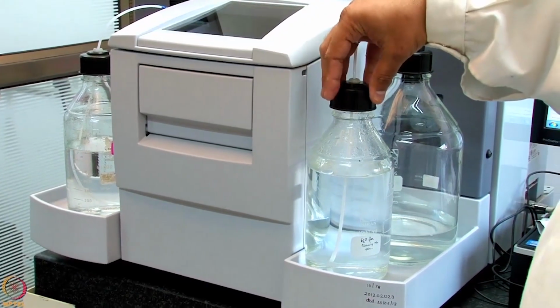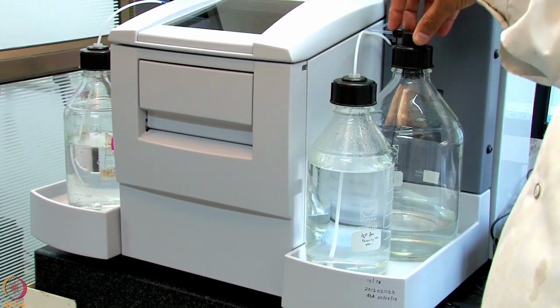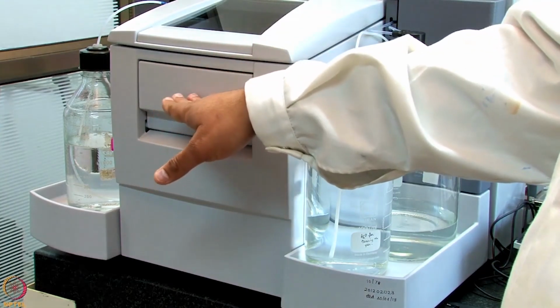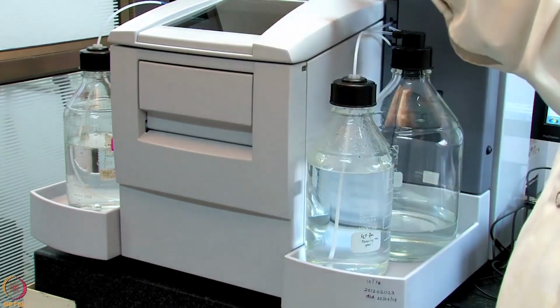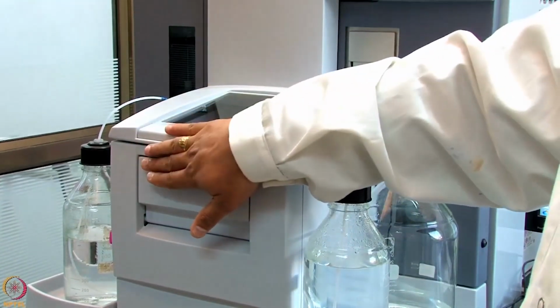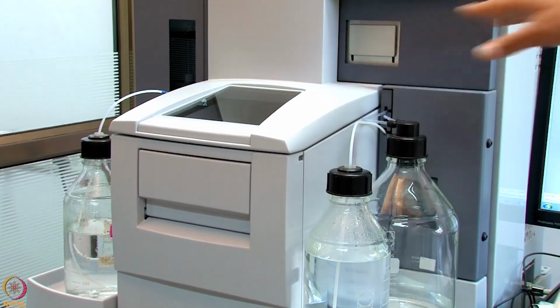Coming here, we have a water reservoir. The water reservoir is useful for cleaning needles and syringe, and we have a waste reservoir here, which collects all the waste. The samples are sent in this compartment. The chip is docked at this compartment. So the experiment starts by picking up samples from this compartment and transferring them to the interaction site, and then the experiment is recorded on the screen.